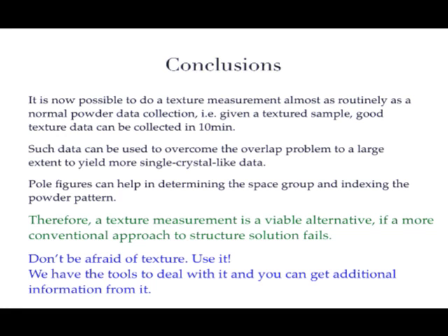So the list of angles, if you sit down in front of the diffractometer and you want to do the experiment, where do you get the list of angles? Is that distributed with Maud? How would I know which angles to type in to the diffractometer? Yeah, that we obtained from Maud.